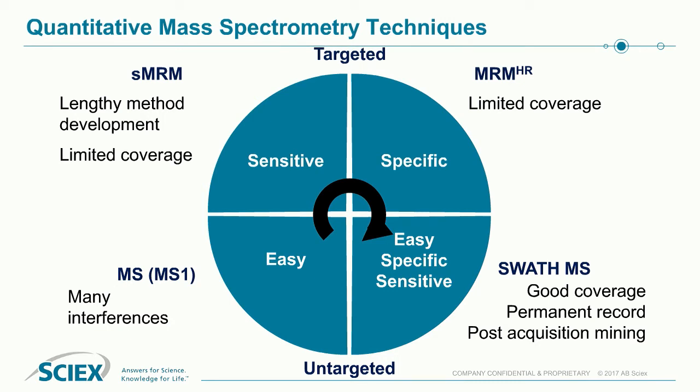So the first method is by far the easiest method, which is down in the bottom left-hand side of the quadrant on the diagram here, which is the MS1. Here you just take the area of the peptide that's eluting and use that as a surrogate for the amount that's present. The challenge is that even though this is really easy to do, it's very difficult to deconvolute those signals in complex samples. And as you start using host cell protein analysis, especially for process development work, there may be many proteins that are present, leading to convolution in the MS1 signal, which is very difficult to remove.